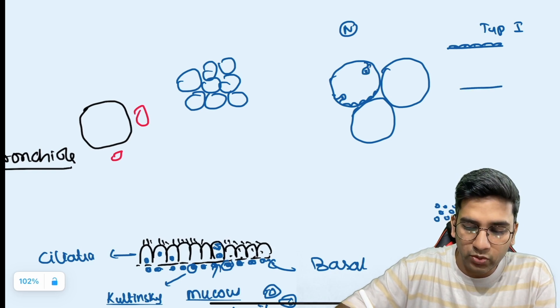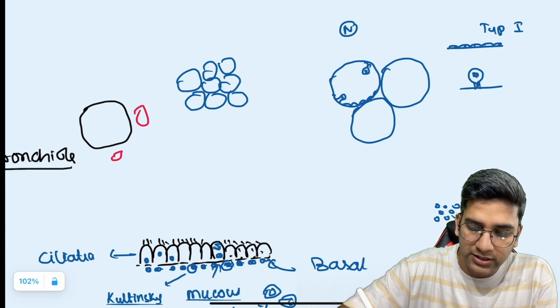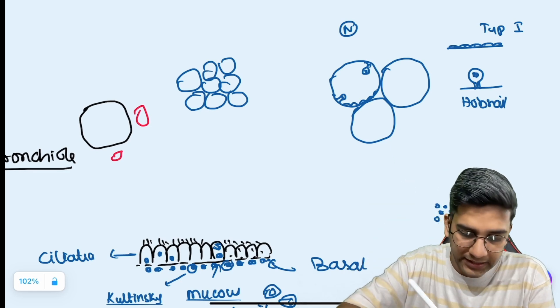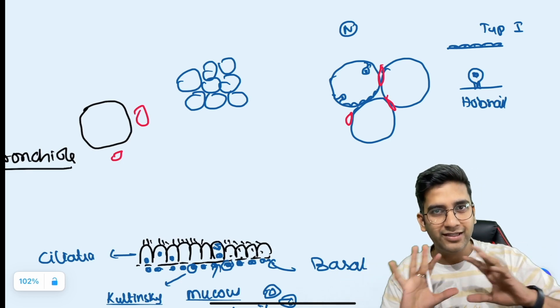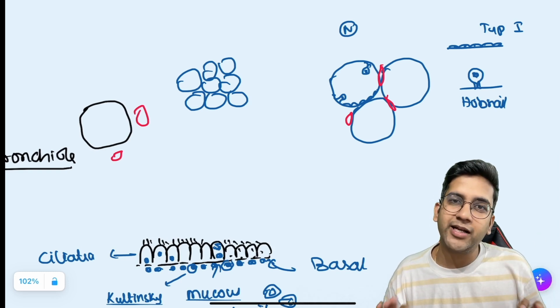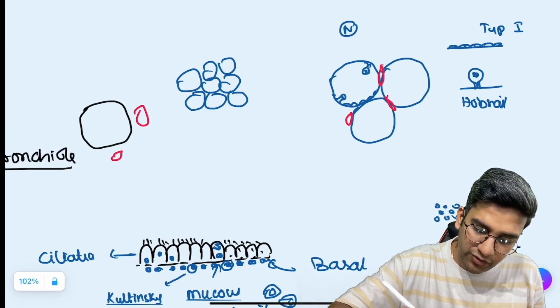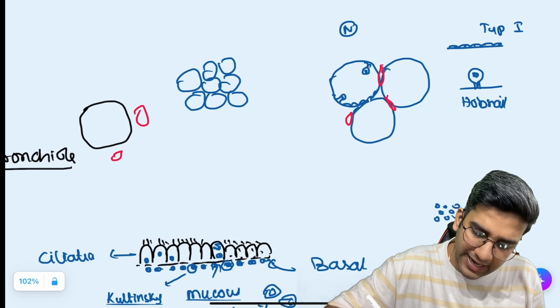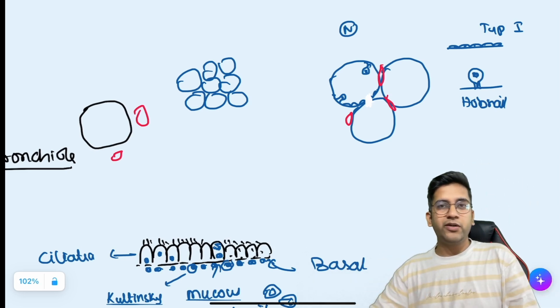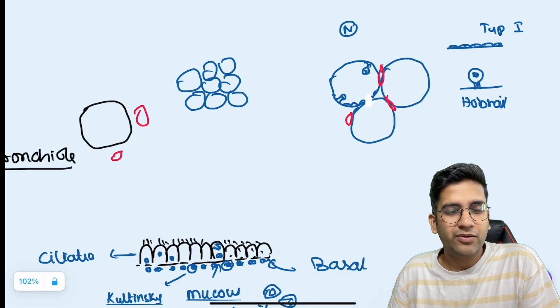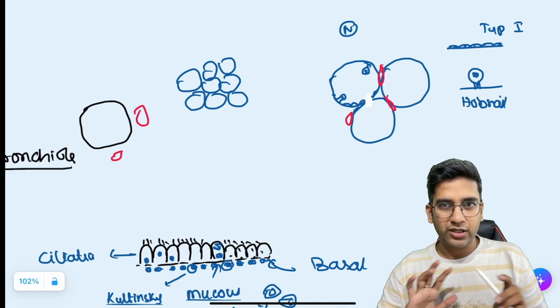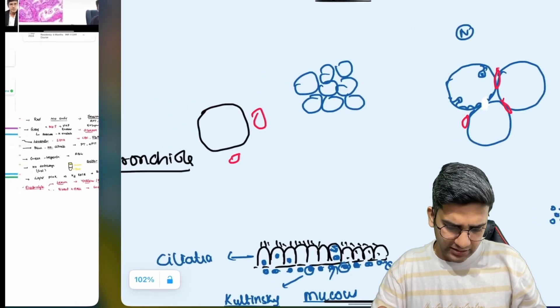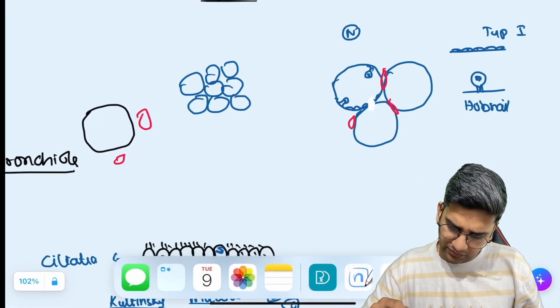Type 2 alveolar epithelium has a little bit of projection. In a normal lung it's pretty difficult to see type 2 cells. This projecting nucleus appearance is called the hobnail appearance — a very classical finding for type 2 cells. In the septa is where you see the capillaries, and that's where air-gas exchange happens. Also, alveoli are connected to one another via pores — those are the pores of Kohn.